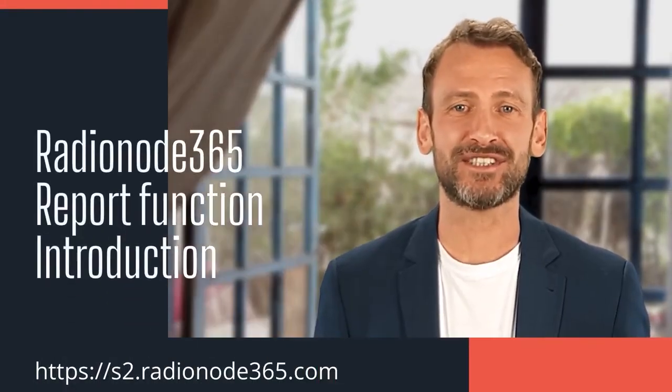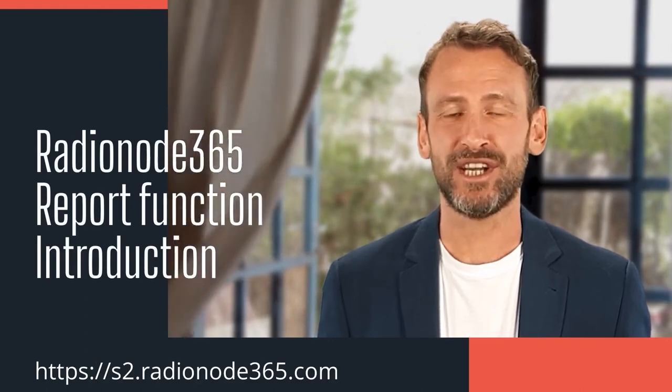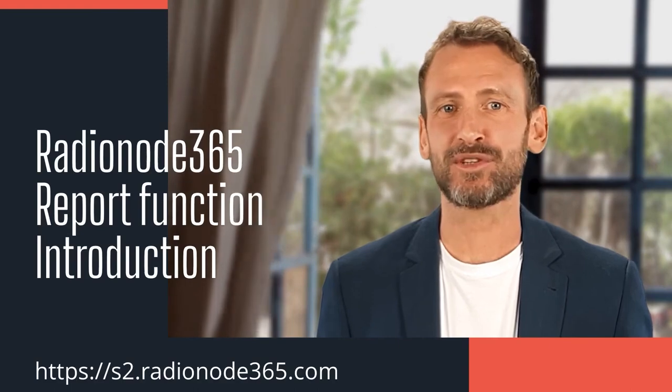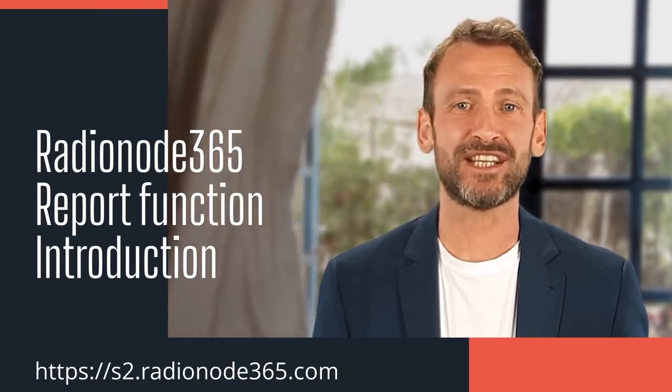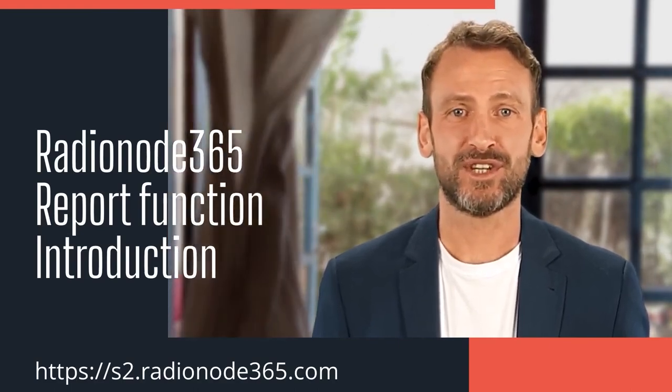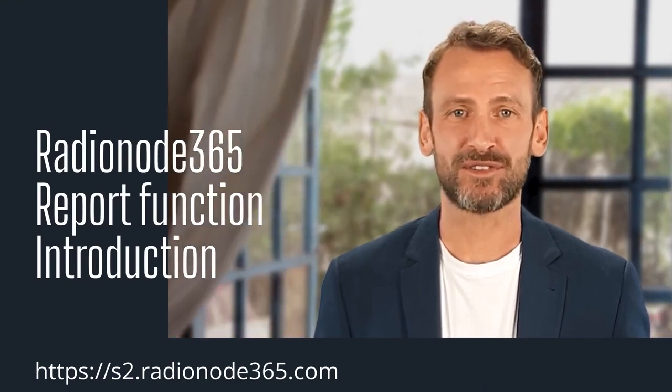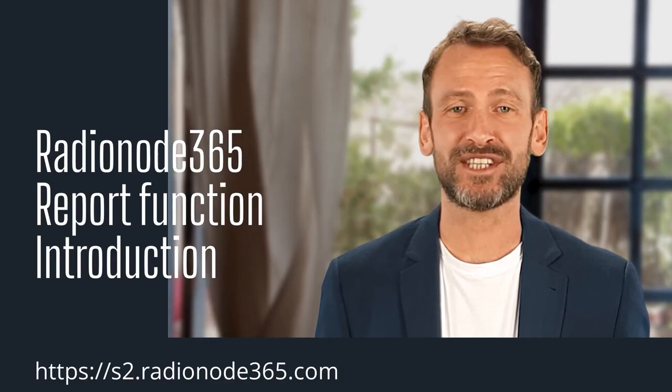Radionode365 not only sends notifications, but also detailed report to whom, when and how notifications are sent, and who received them and what actions were taken can be managed thoroughly. Your valuable information is safely protected while leaving a history for future reference, so please use it with confidence.